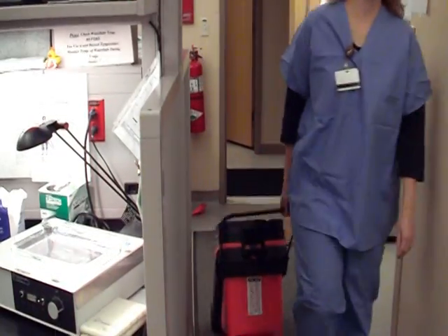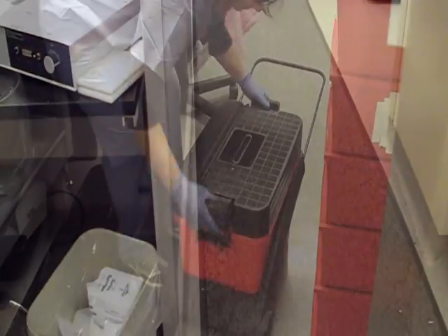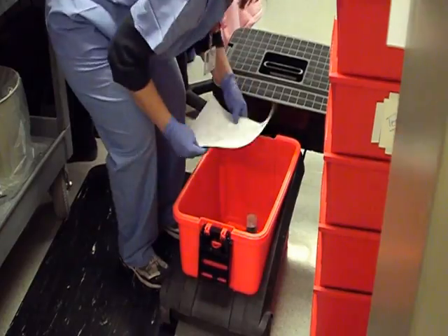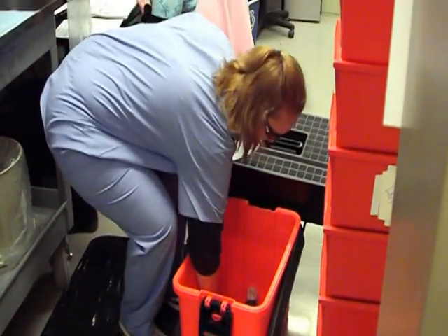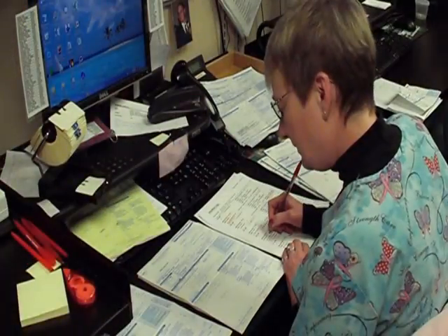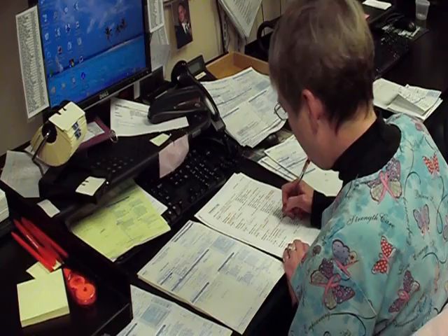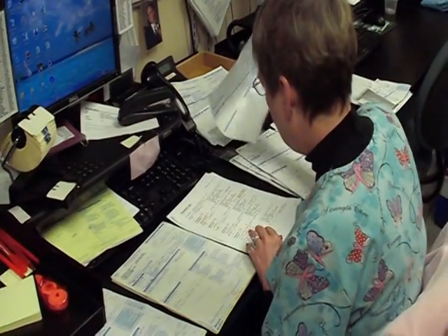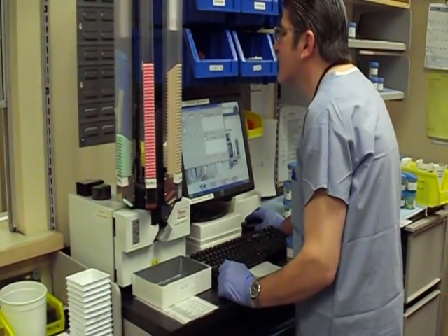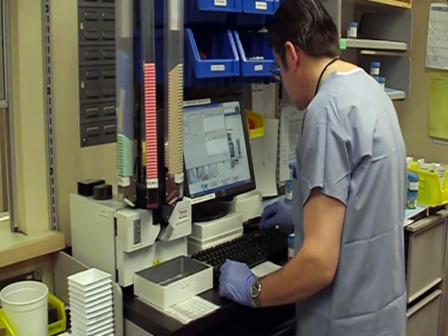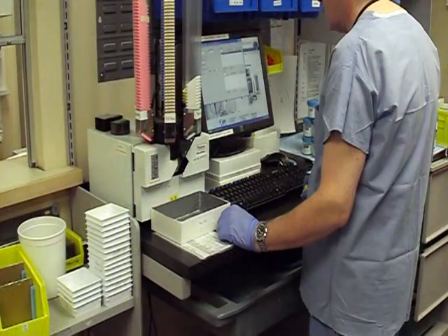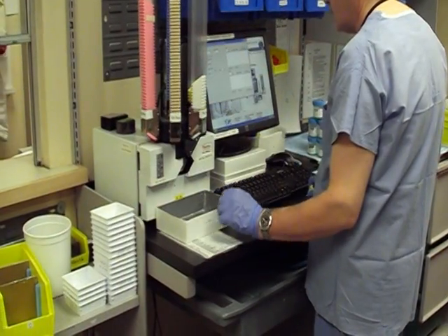A lab assistant transports specimens from the OR and other clinics to the accessioning area in surgical pathology. Each specimen container holds a separate biopsy. Another lab assistant compares paperwork, ensuring that tissue type, patient name, and other information match. A specimen number is assigned to each case and histology cassettes are printed with that number.